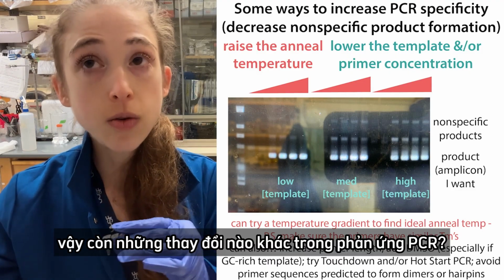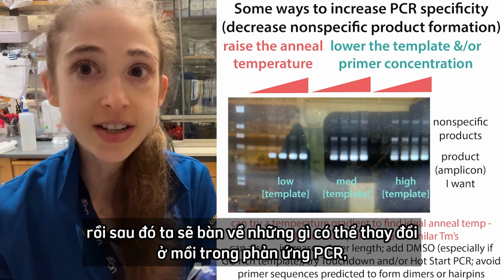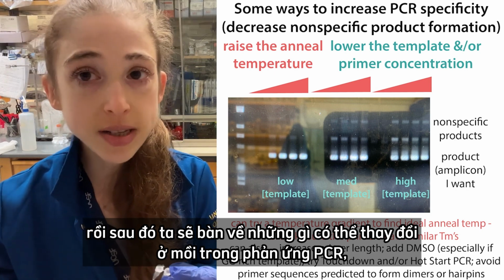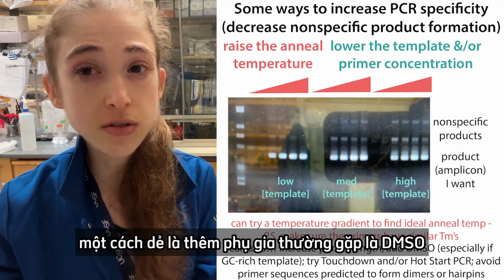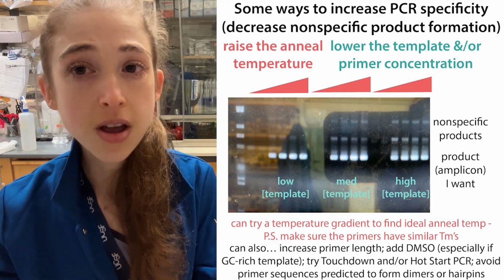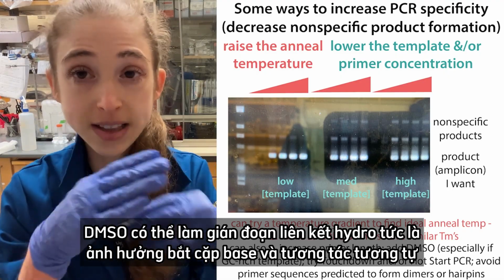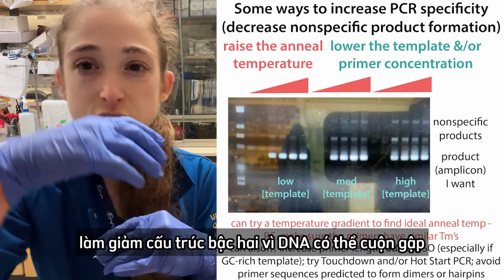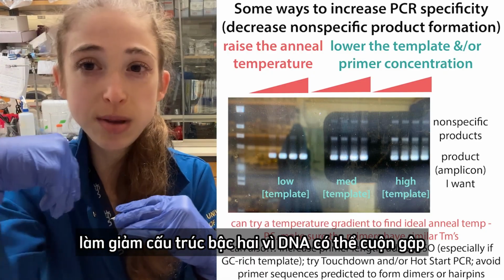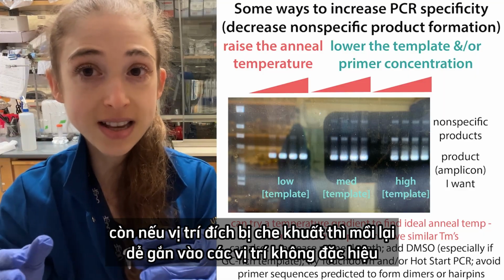Okay, so what else can you change in your PCR reaction? And then we'll look at what you can change in your primers. In the PCR reaction, one easy thing that you can do is just add an additive, commonly something like DMSO. What DMSO does is it can disrupt hydrogen bonding, so the base pairing, and disrupt secondary structures, so the DNA being all folded up. This is going to make it easier for the primer to find the sites that you want.